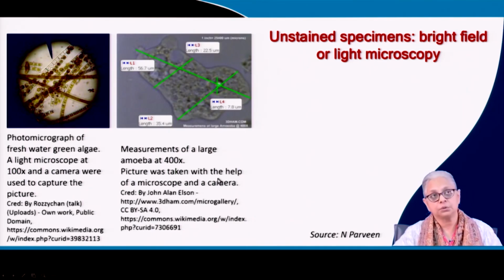So you know, with all the technical advancements with light microscopy, you can do a lot more today than was possible maybe 30 years, 40 years ago.